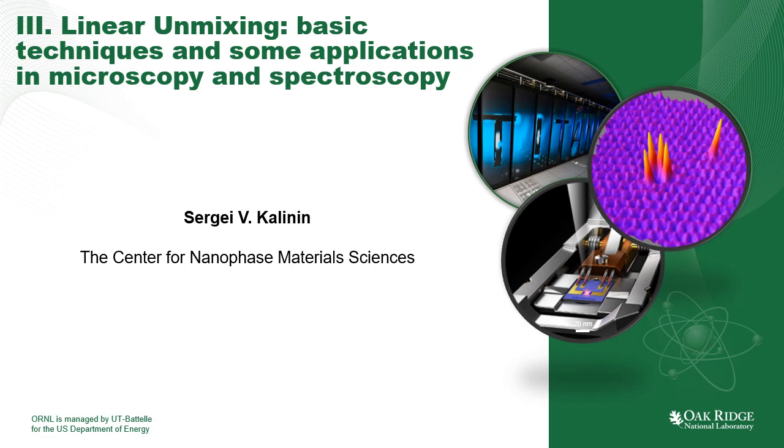Hello, and welcome to the third lecture in the series of lectures on applications of machine learning, big data, and artificial intelligence in scanning probe and electron microscopy. In this lecture, we are going to get a little bit of taste of the linear unmixing methods, including some basic linear mixing techniques and applications in microscopy and spectroscopy.